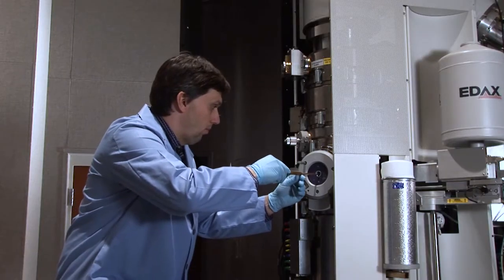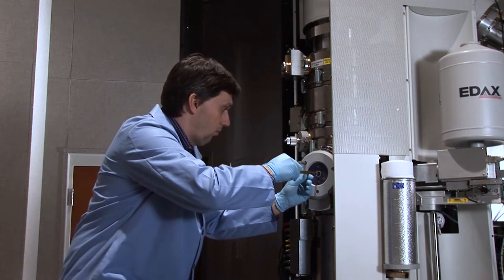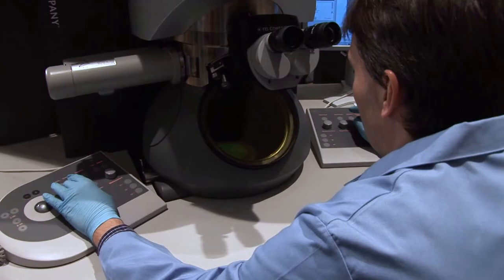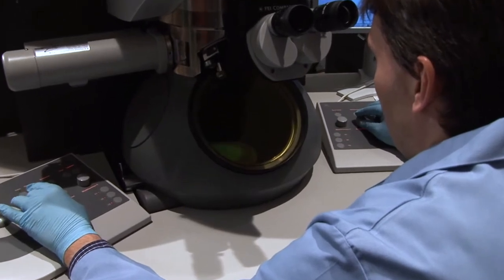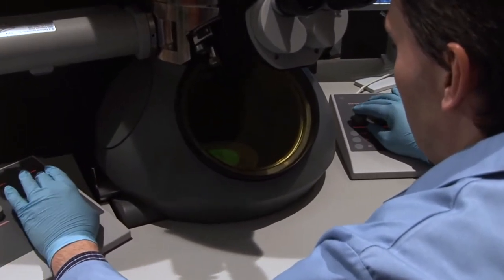The unique feature of this instrument is that it allows us to study our samples under well-defined environmental conditions. Unlike conventional transmission electron microscopes that are operated under high vacuum, we can control the environment around the sample and probe the properties under relevant conditions.